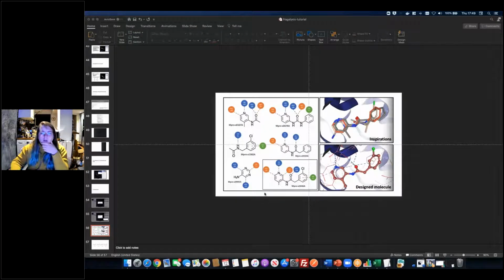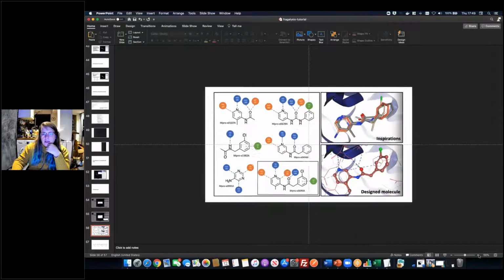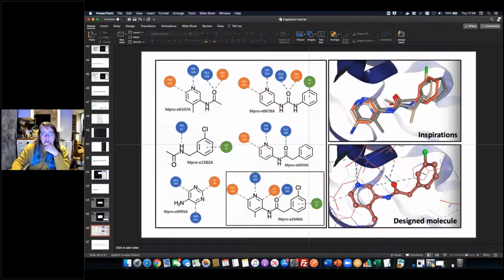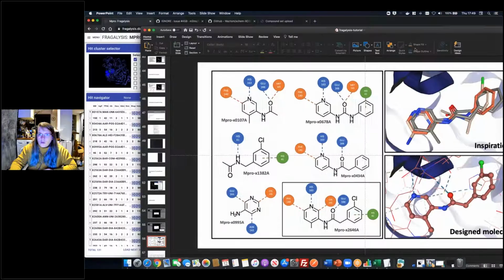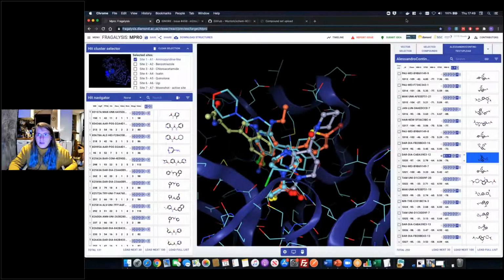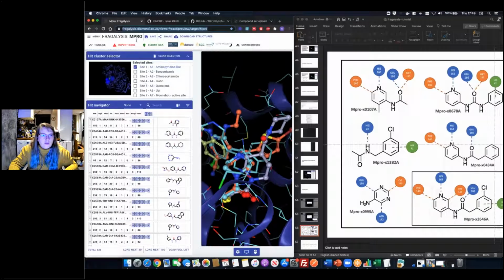project, there is a molecule that was designed in Fragalysis in this concept of looking at the overlay of ligands together and seeing how you might merge them together. So these are snapshots from Fragalysis. There are 5 different ligands that were used to design a new one. And I guess we could turn them on, and I'll demonstrate another feature of Fragalysis to you while I'm there, which is that it's really terrible on a tiny screen. No, that was a joke.